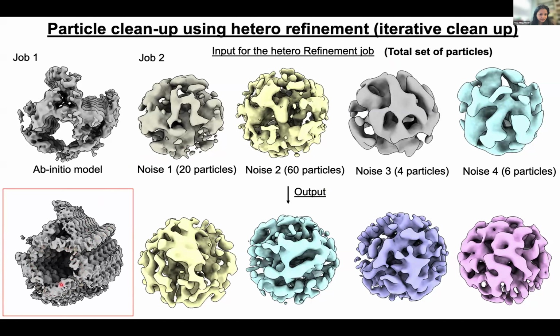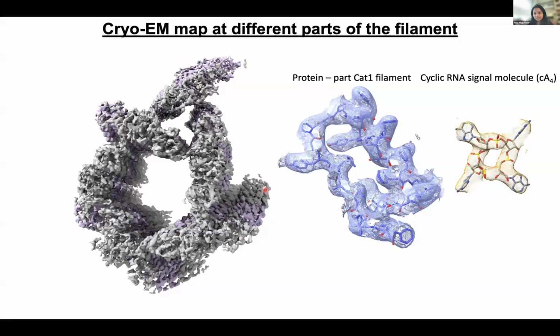So we were interested to know how it forms this filament network, and also how it dissociates, because that is very important, biologically relevant. Otherwise, bacteria can't survive again after the infection is over. So these are the questions we are asking in cryo-ET experiments.